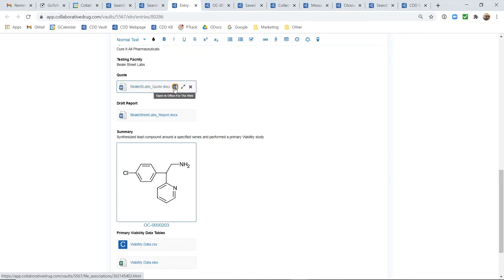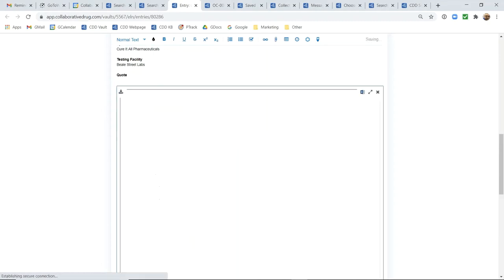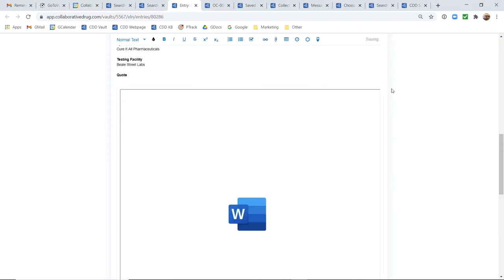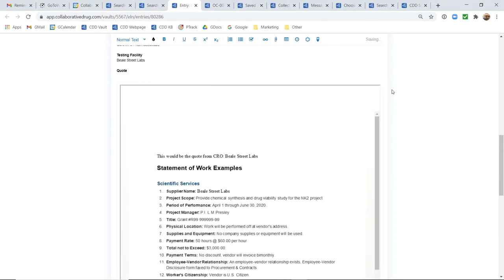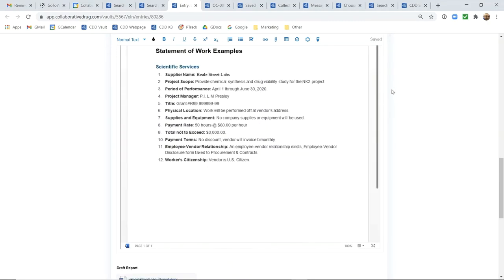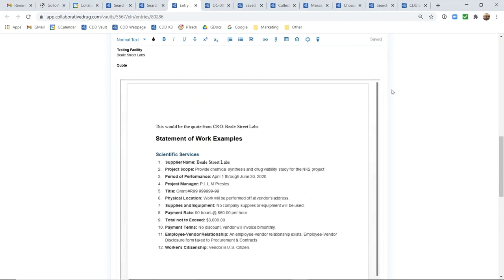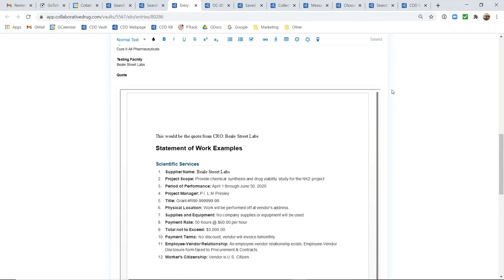So if I clicked this Word icon, this file would be opened and we could edit that inline or directly here within the ELN. I can also choose to change the preview size of this office document so I could click that diagonal arrow and the document would open here inline for viewing within my ELN canvas.